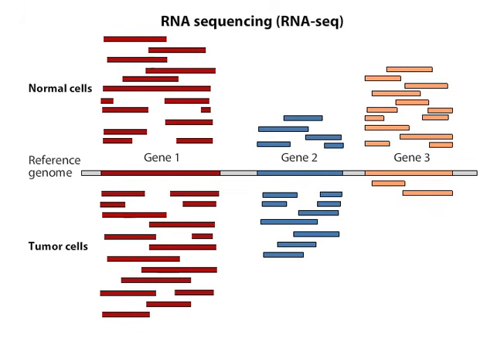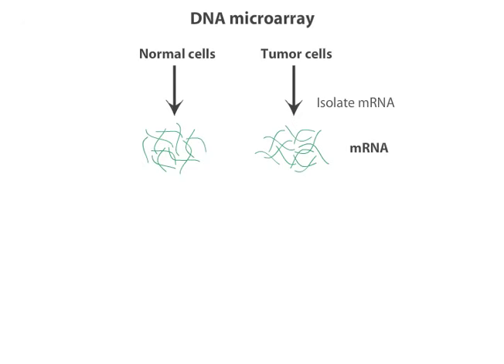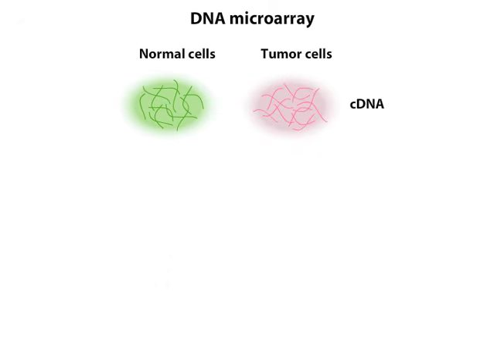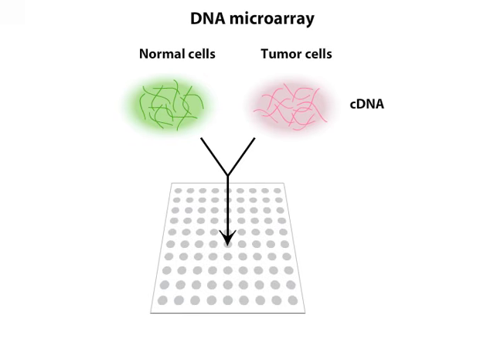Many researchers are transitioning to using this technique of RNA-Seq and away from using a similar method developed earlier called DNA microarray analysis. In brief, in DNA microarrays, the two mRNA samples are processed in a similar way. However, the cDNAs are fluorescently tagged to distinguish the two pools. The cDNAs are separated into single strands and added to a microarray, where they hybridize to complementary oligonucleotides affixed to each spot. Each oligonucleotide corresponds to a known coding region of the genome.